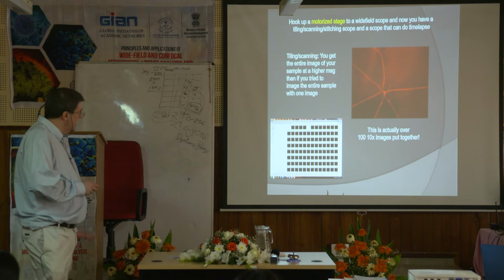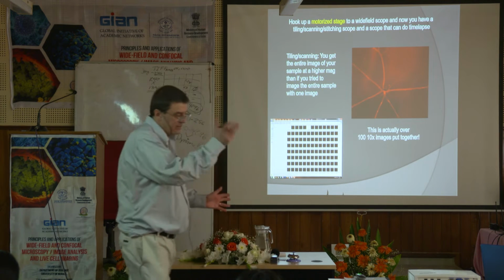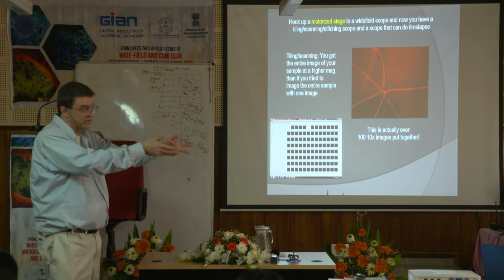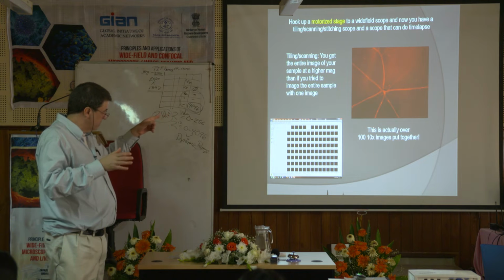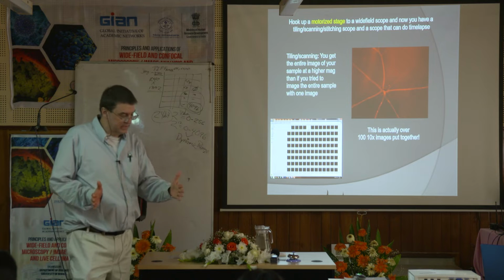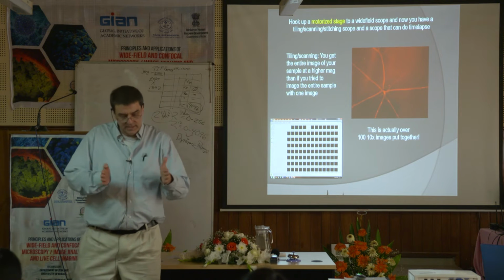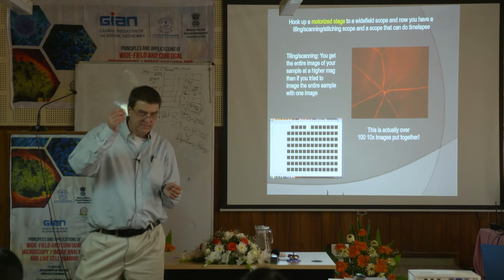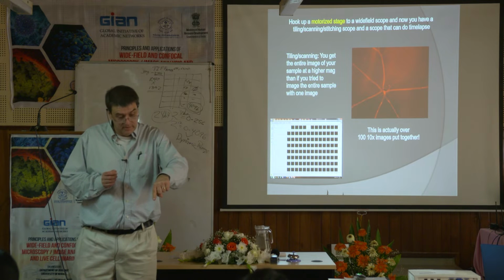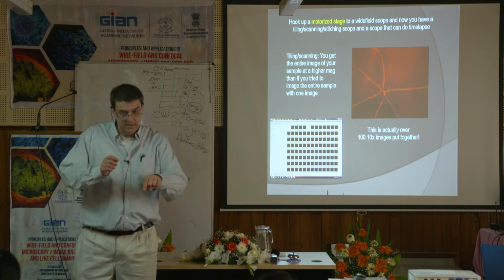The one thing I have on my particular microscope is an automated filter changer, so I can change my colors automatically with Metamorph software. And then I have what's called a motorized stage. A motorized stage basically sits on the microscope, and it's the part you put the slide on. But mine can go around in X and Y and move to a certain spot. And it's a very precise instrument. So I can go to this cell right here, and then I can program it to come back to that exact same cell, again and again and again.